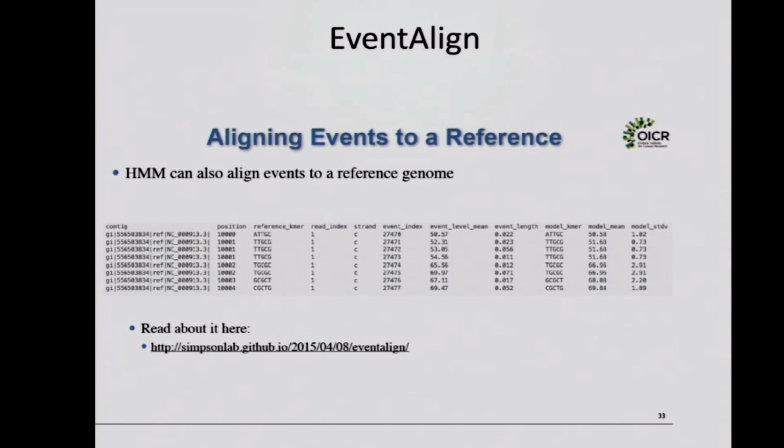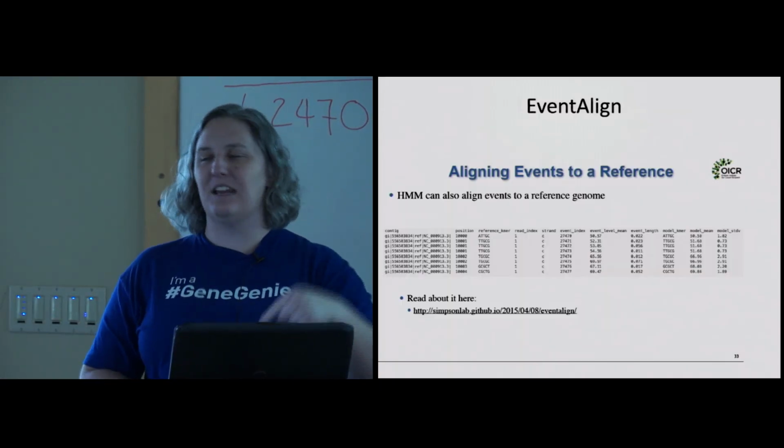All right, event align is something that's fairly new. This is going back to even more raw data than before. All of the alignments more or less rely on the consensus sequence, corrected frequently, but these are full length 900, 2000, 10,000 base pair reads. However, event align takes the k-mers, these 5-mers, these 6-mers, and goes, okay, I don't need to rely on what Oxford says the actual read is. I'm going to go back to a more unprocessed level because I can figure it out better.